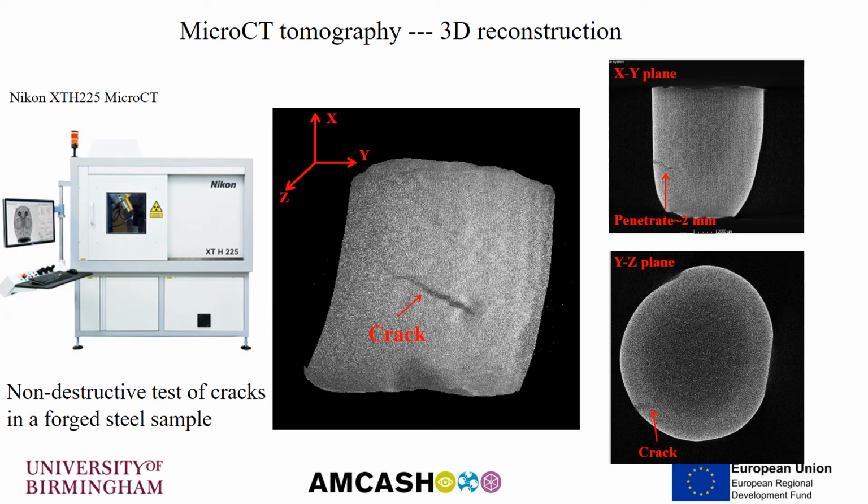The last example is about MicroCT tomography analysis. MicroCT is similar to the X-ray test in hospital, where the X-ray will penetrate the sample, leaving a 2D image. For MicroCT, with the rotation of the stage and the specialized software, it can offer a 3D reconstruction.